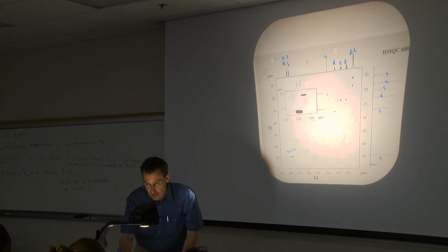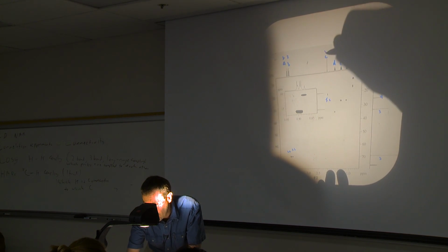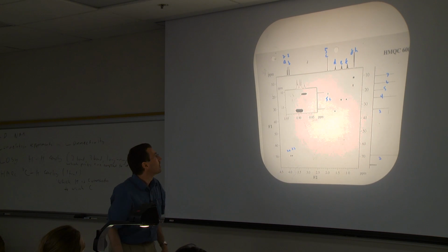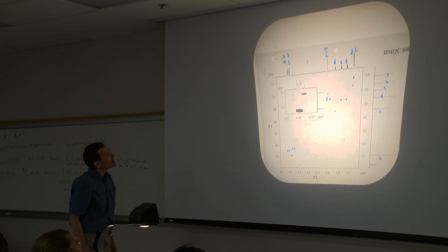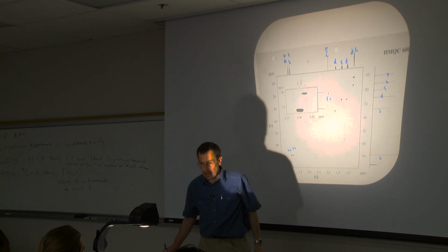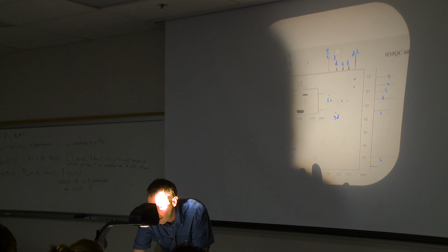We get 5 connects with C over here. I walk along the spectrum. We get 3 connects with D over here.